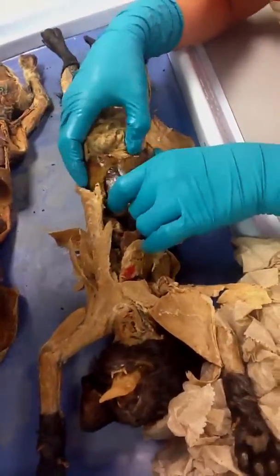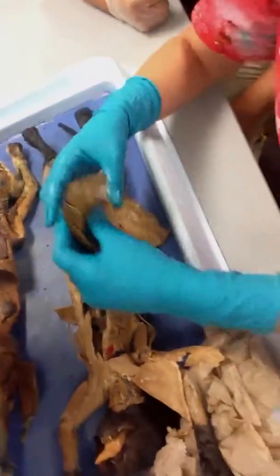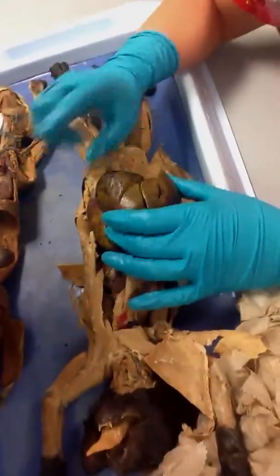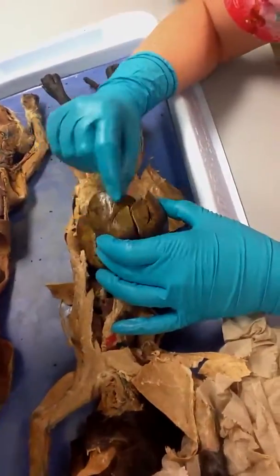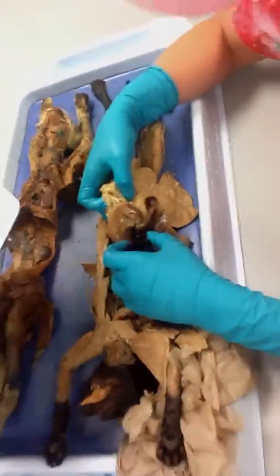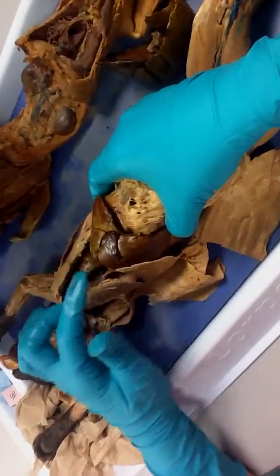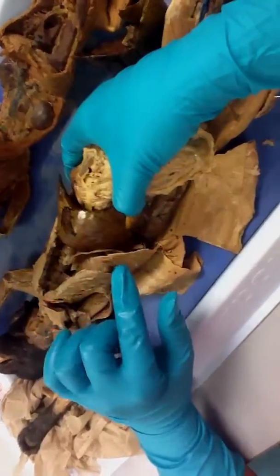And then we get to the liver. Our liver has multiple lobes. Here you see we have the left lateral lobe that sits on top of the stomach. Left lateral lobe. Left medial lobe. We have the quadrate lobe. We have the right medial lobe.